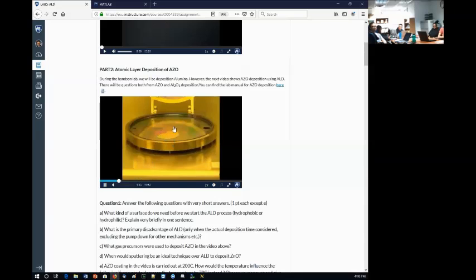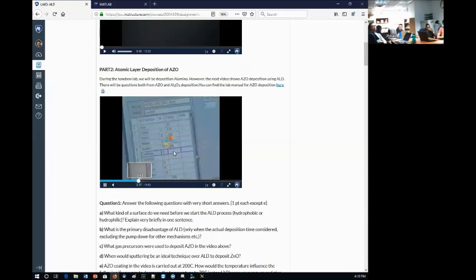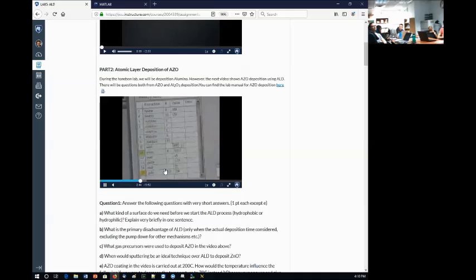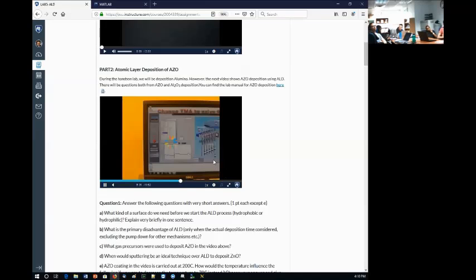So you load your sample onto your substrate heater, and then you give your recipe to the tool. This is the recipe for the purge time, or the time to actually flow in the gas and extract the gas, the byproducts out. So you enter all of them. The resolution is a little low, but okay.